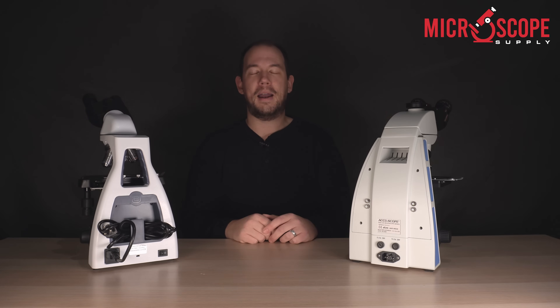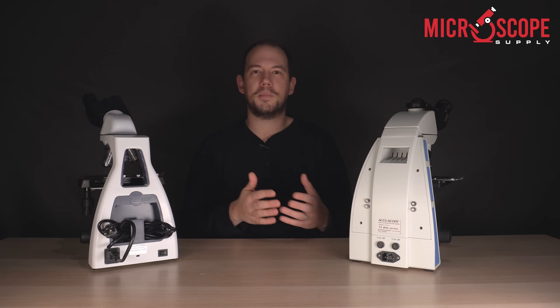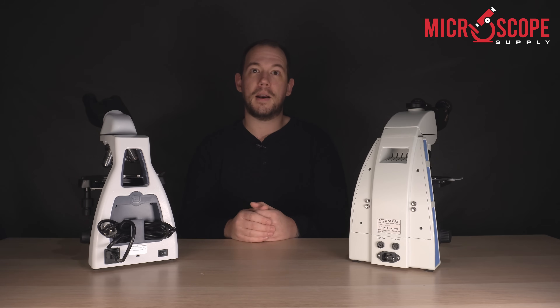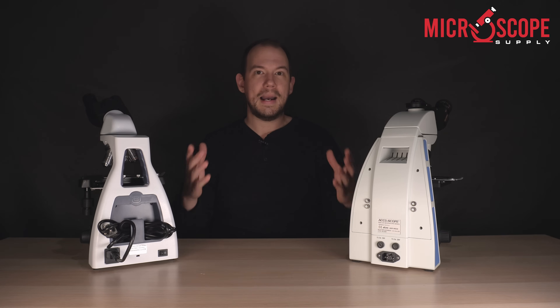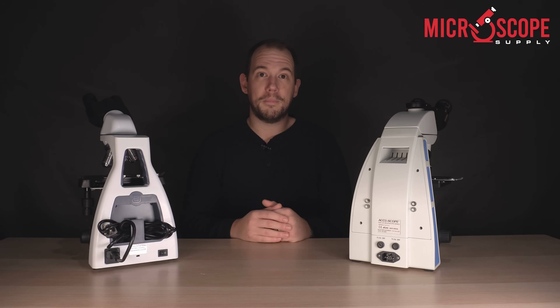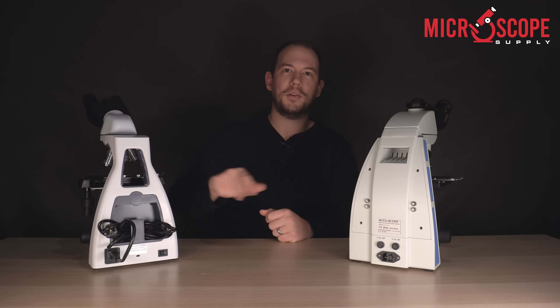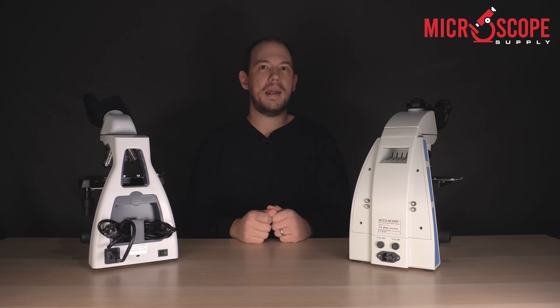And finally, number five — and this one may not be for everybody, but certainly if microscopes are being purchased for a classroom environment, a college or university, this is a big one: cord storage. I see it all the time — I go into a college or university and they've purchased microscopes without cord storage. What happens? The cords get wrapped around the head, wrapped around the objectives, sometimes too tight, and that can cause damage.